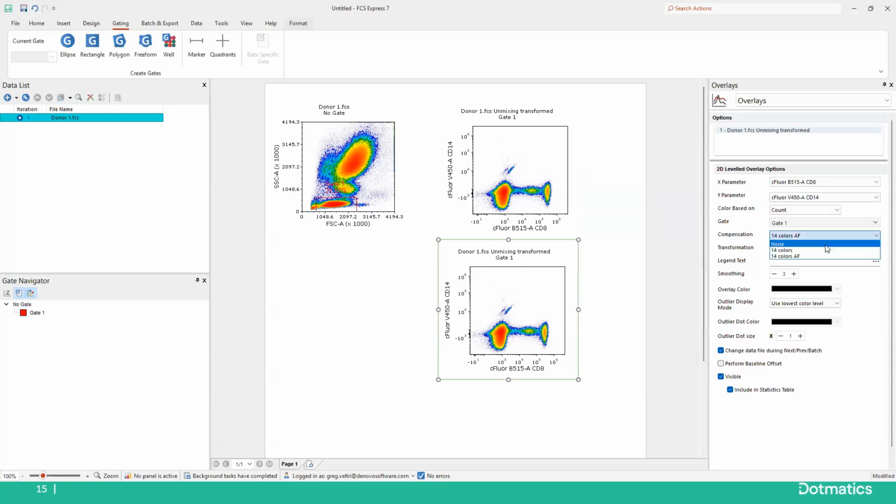And we can do none and see if it applies it. So it's just a good panel. But the most important thing is not so much that you're going to see a difference here, more that you're able to do the different matrices to allow you to look at different plots and different things.